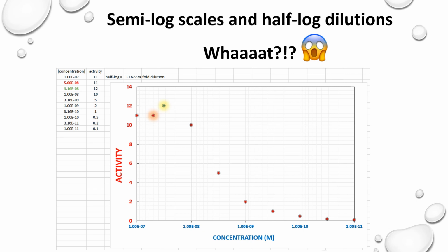So very easy. If we want to make dilutions in order to test a particular protein, for instance, and see what its activity is on cells, we can just go for straightforward 10 times dilutions, and that's an extremely efficient way of bridging or reaching a very high range of concentrations in a rather limited number of steps.